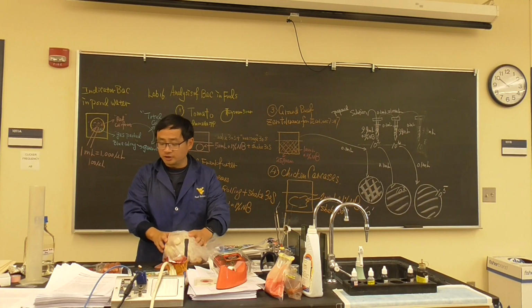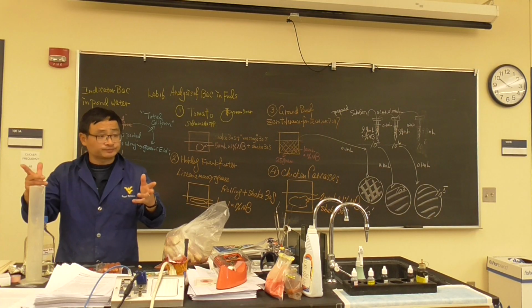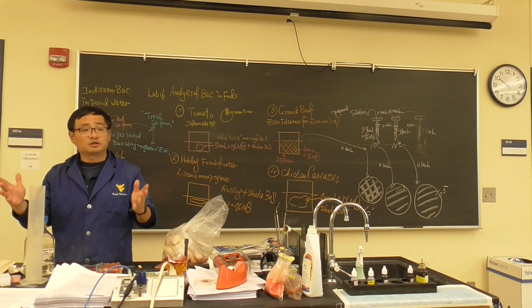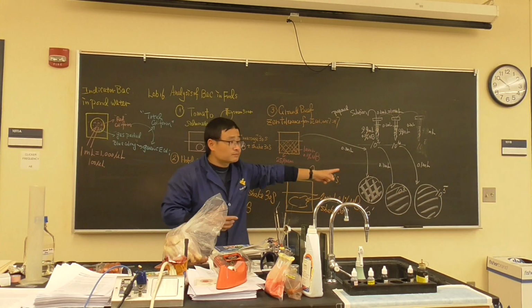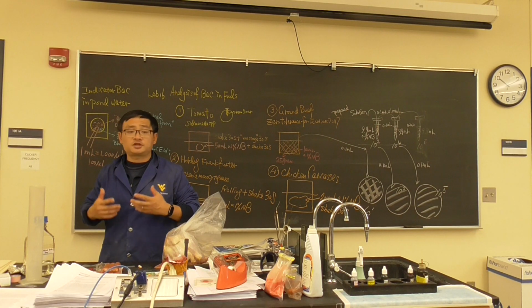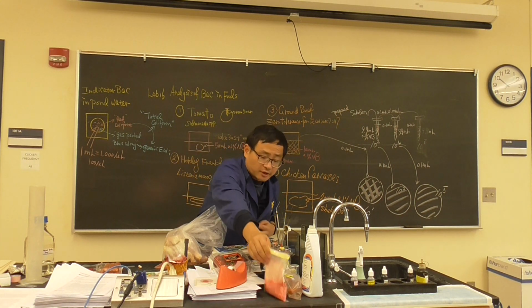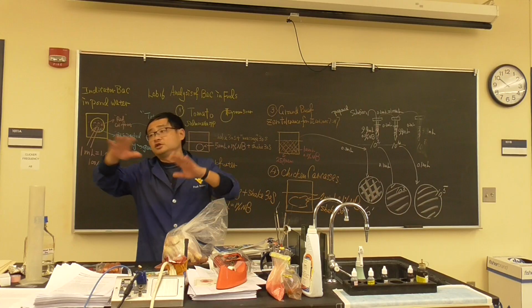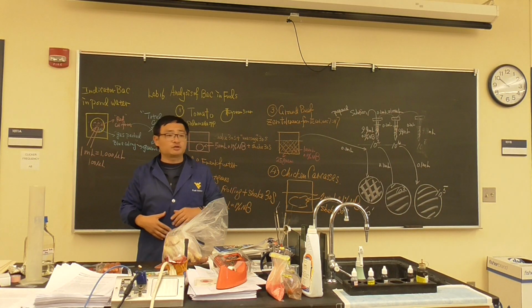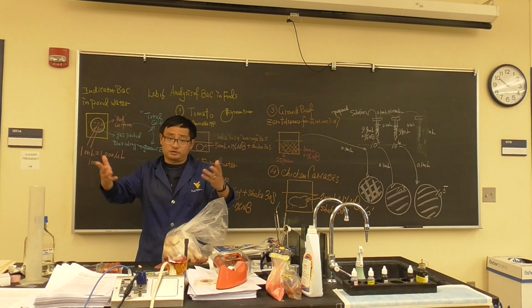Other students will be doing it by yourself. Let's just do a pair for preparing the sample, but when you do serial dilution, everybody does individually, okay? Which means you share one sample bag of the ground beef, but when you do the spread plating and dilution, you do individually, then you get practice. If some of you are really interested in doing individually, you're welcome to do an individual set.